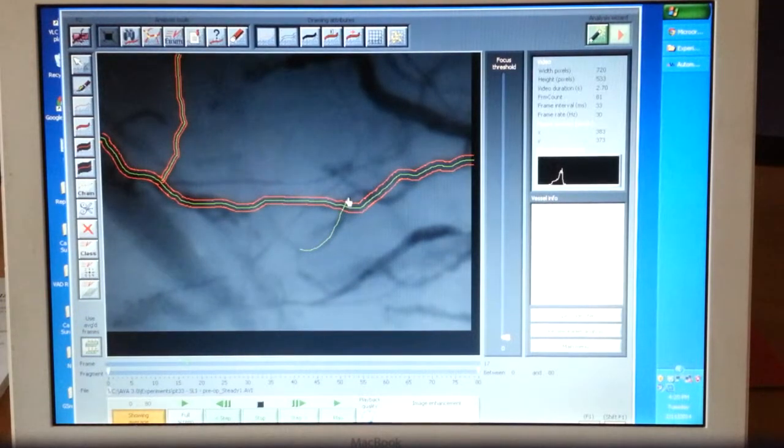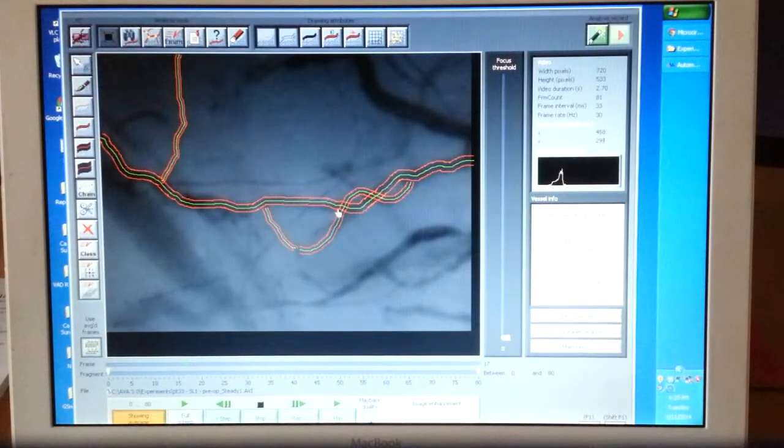Now, let's say you're working and you're drawing this vessel right here. And you do a nice job there. You get the thickness and everything. And then you go ahead and also draw this segment here. And then you're like, okay, I want to chain this segment with this segment here. But you accidentally click, let's say, this with this thing. Now what you've done is you've chained this small segment with this entire thing here. If you were to choose the delete button, you would delete all the work that you've done, which is a huge pain in the butt.